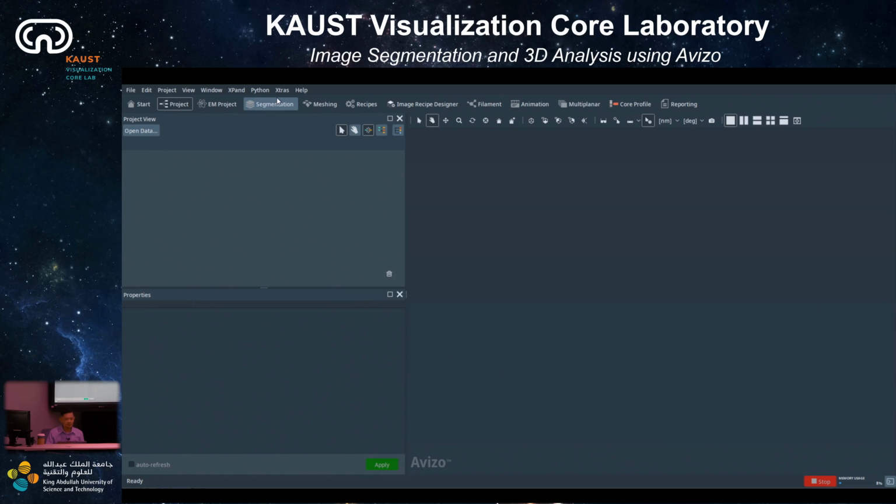It's worth mentioning that because it's still a beta version, later we will have this data embedded in the Avizo software. But right now, we need to do an extra installation. If you click on extra, you don't see it here, but on my screen we have the extra installer. So just click on extra and then extra installer.